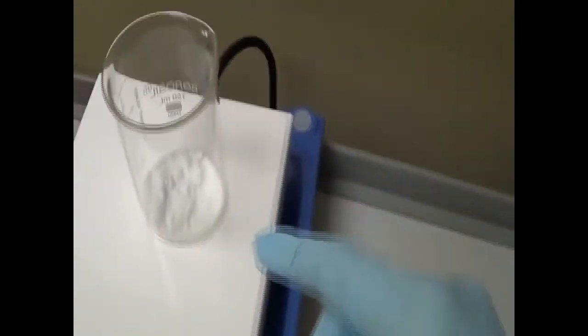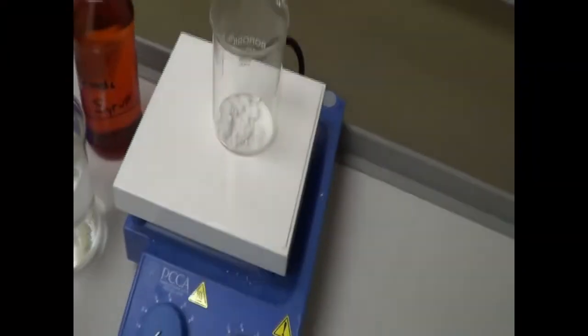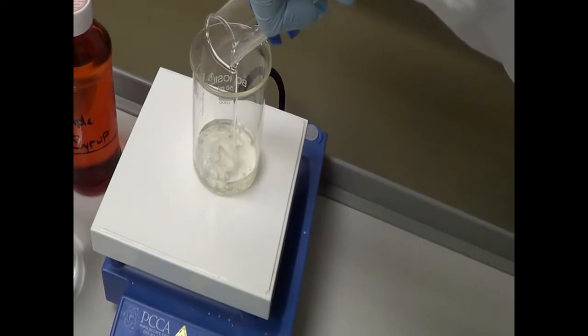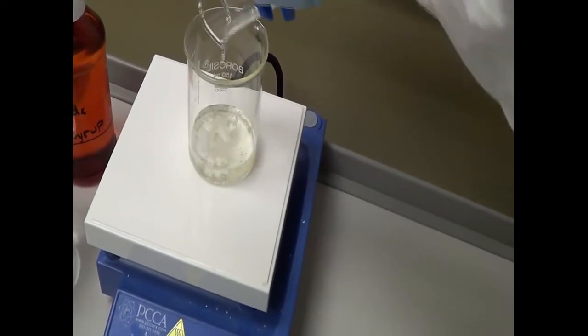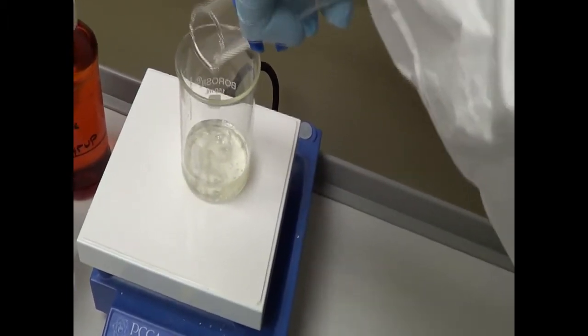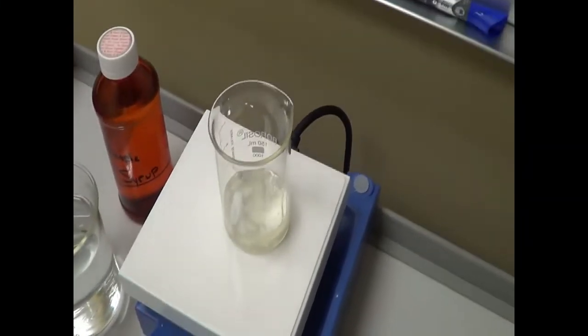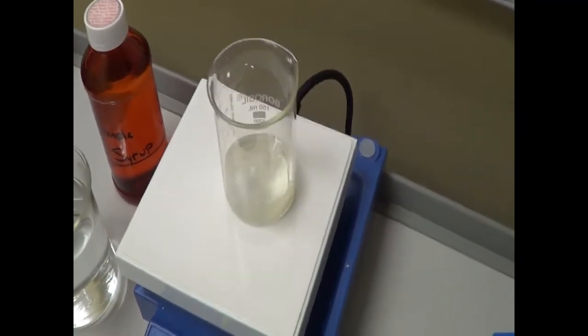As you can see, we have a stir bar inside the beaker. And to this we are going to add 30 ml of glycerin. So 30 ml of glycerin we added — make sure you pour all the glycerin in. I transfer the glycerin to it. Now I turn on the stir bar.